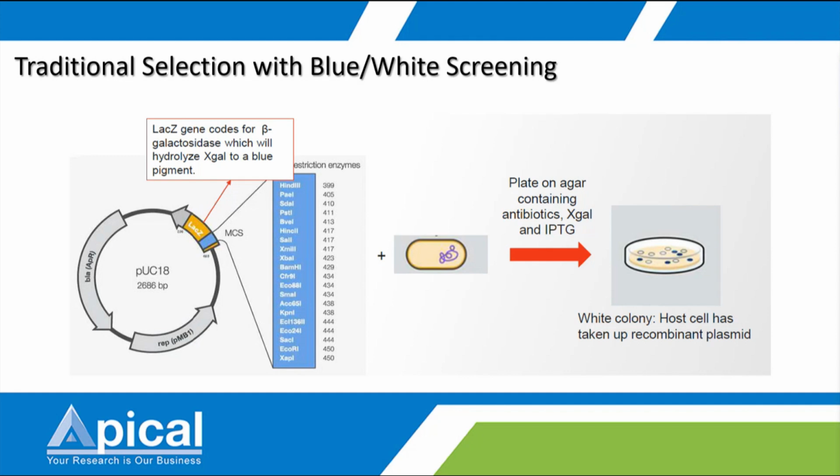When you perform cloning, the insert goes into this lacZ gene. So when there is an insert, the lacZ gene is broken into two parts and will not express.